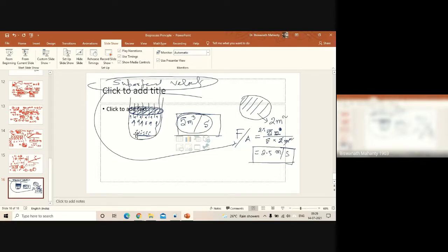For mixing, air is in the form of gas bubbles, right? It is a gas. You can see the bubbles, and it is not dissolved. If I put some sugar in water, can you see after some time that this is sugar and this is water? Can you identify it? No. This is a complete solution. But when a gas bubble is coming, is it inside the water?